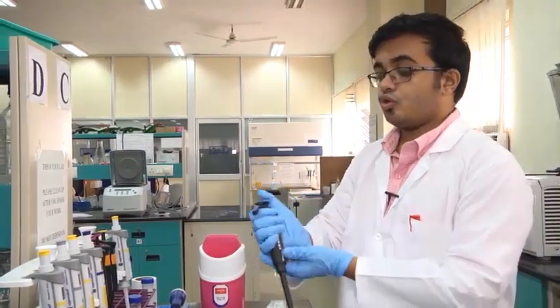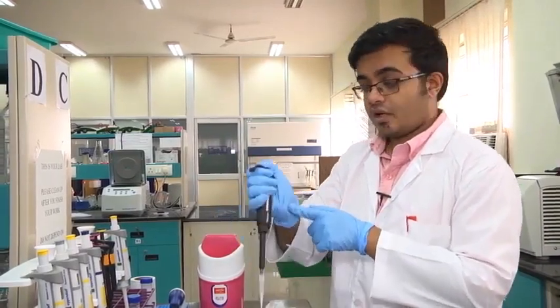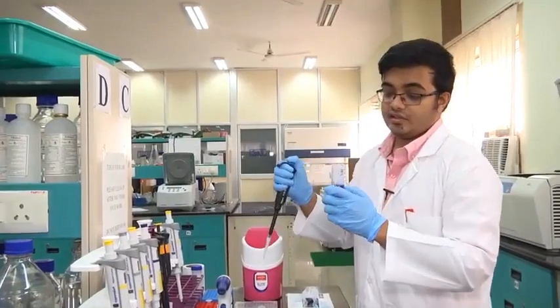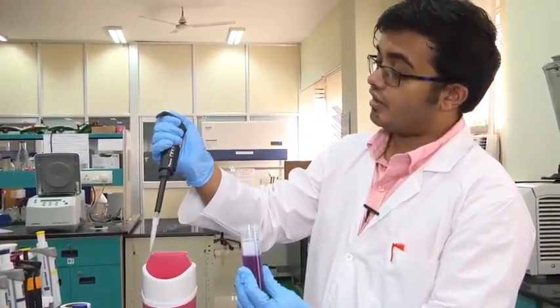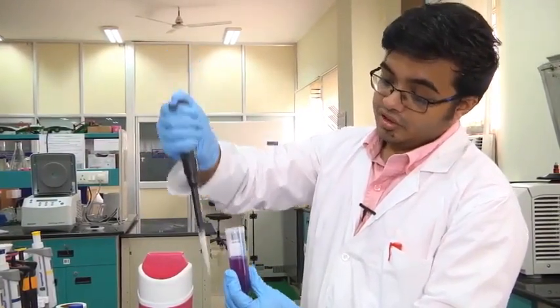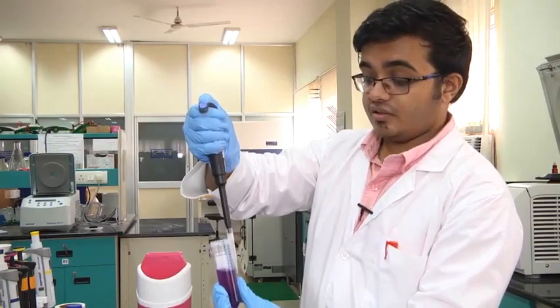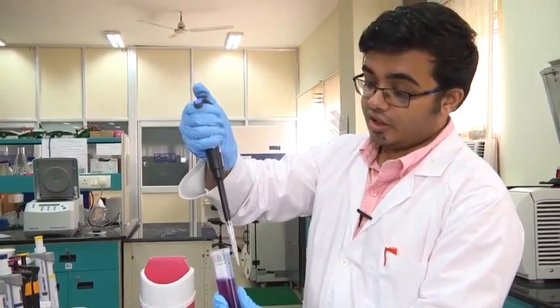For collecting liquids, you should press down the plunger or the piston until it reaches the first stop, hold it there, and then you dip it into your tube. So I want to collect this liquid. I'm pressing down until I reach the first stop. And then don't dip it deeply into the liquid. Don't go in so deep. That's not good practice. Don't stay too much at the surface either, because then you take the risk of collecting air bubbles which will put errors in the volume that you are calculating.